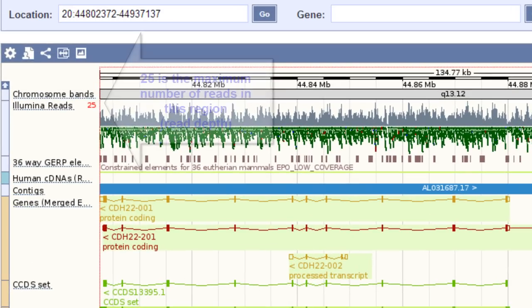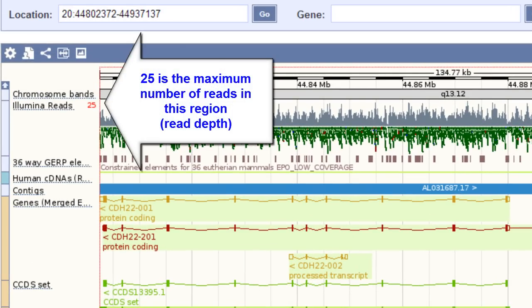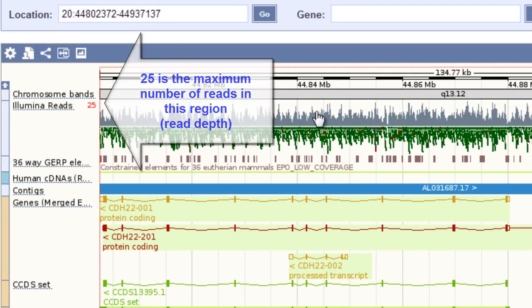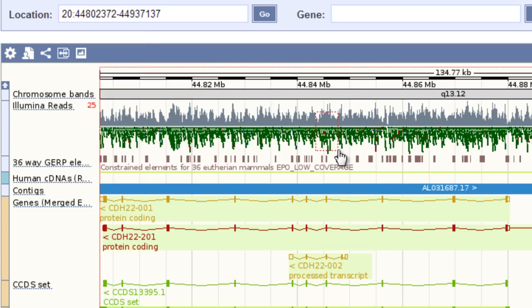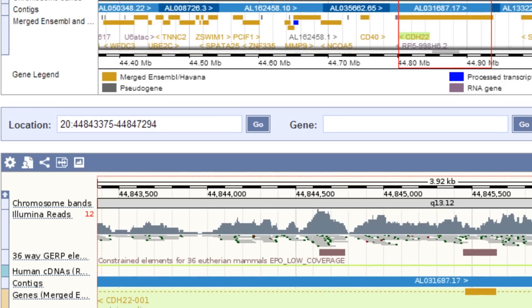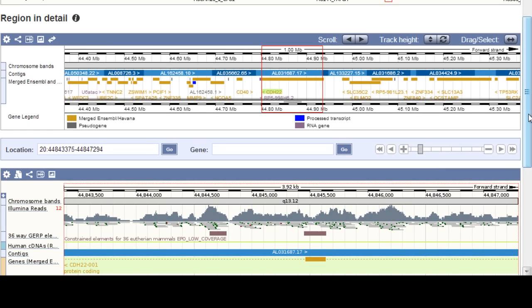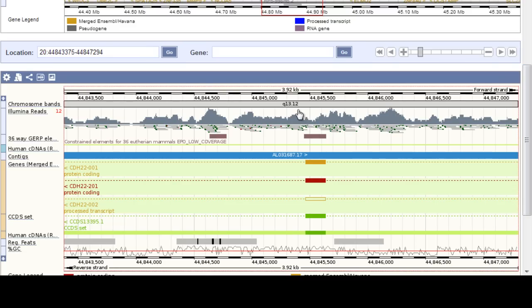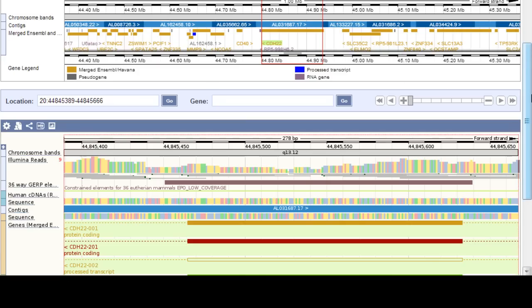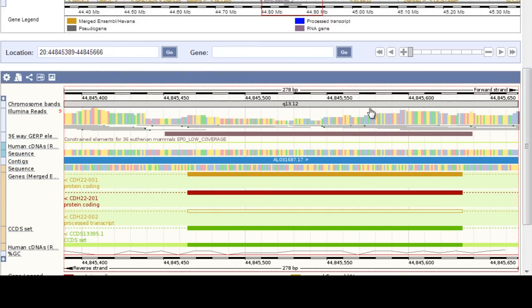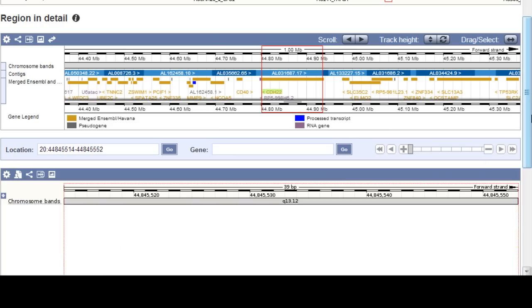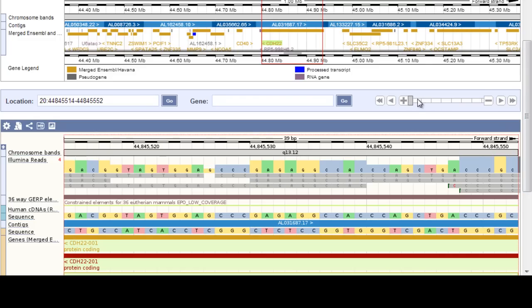If I zoom in by clicking and dragging with my mouse, I can see the sequence of the reads themselves. You have to zoom in pretty far to see the actual sequence. I'm just going to zoom out again using the zoom slider.